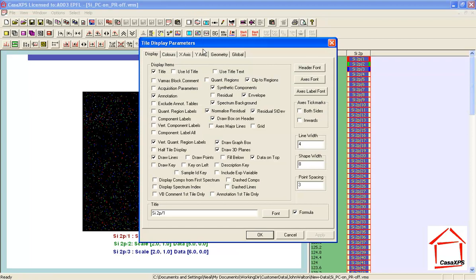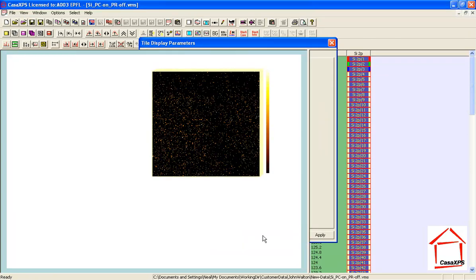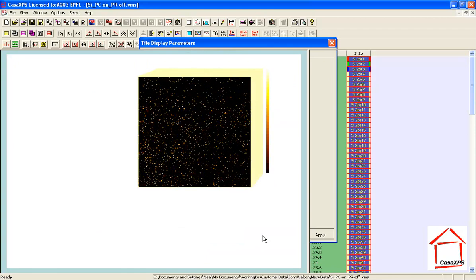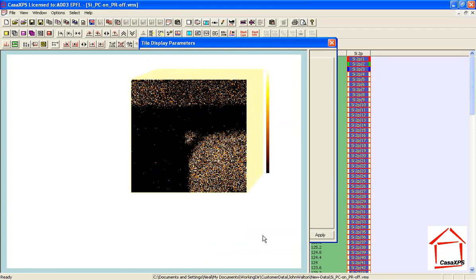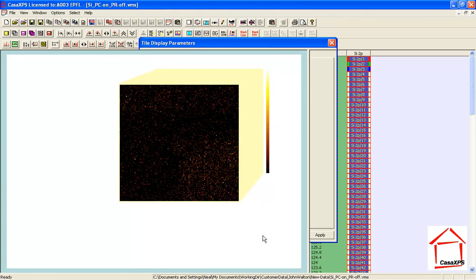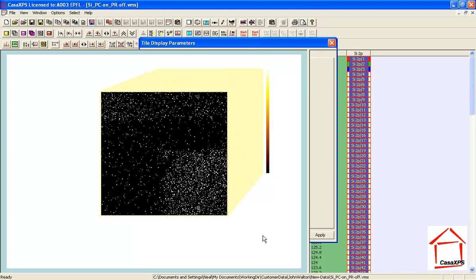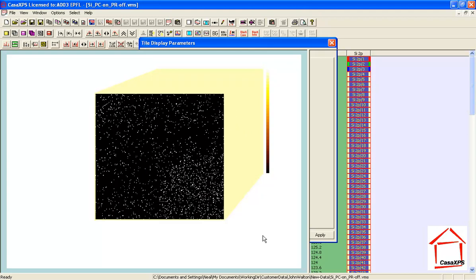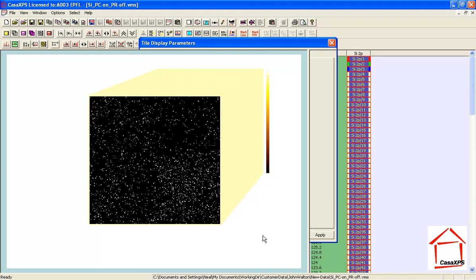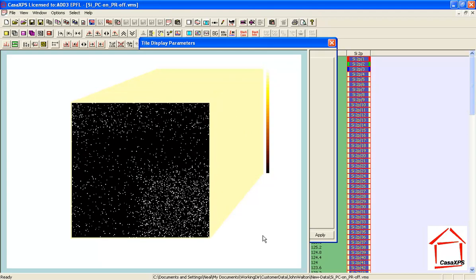We illustrate what these images look like as a stack by plotting them in three dimensions. We can see as these images slowly display that the image changes depending on whether we're on an oxide or on the elemental form of the silicon.